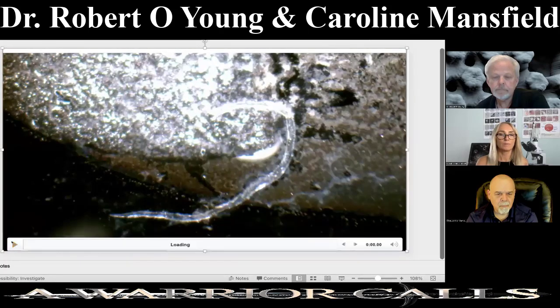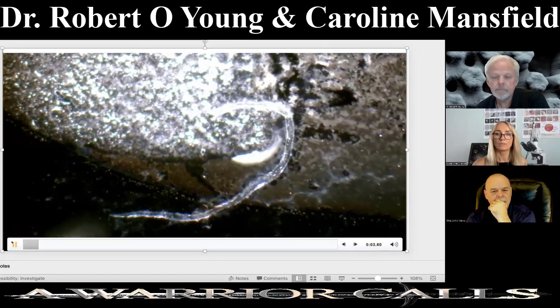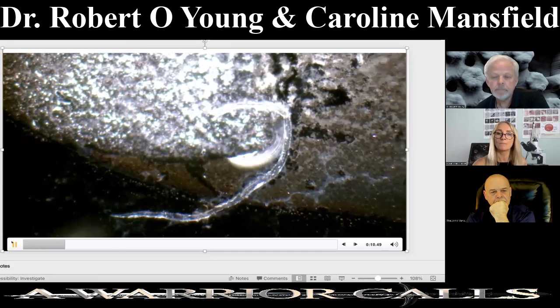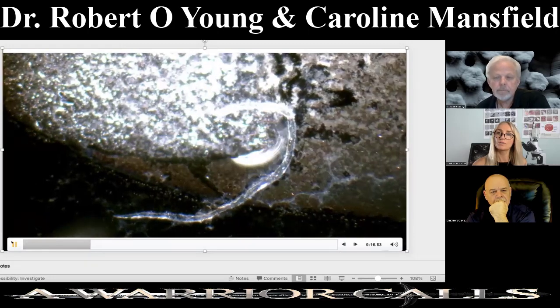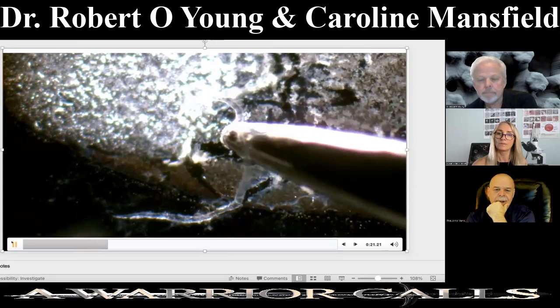Let me just play this video. What I did was I was able to take the cover slip off after adding the MasterPeace, and I used a needle to see if I could somehow prod at this structure, because everyone's observing them. Wow. And there we go.